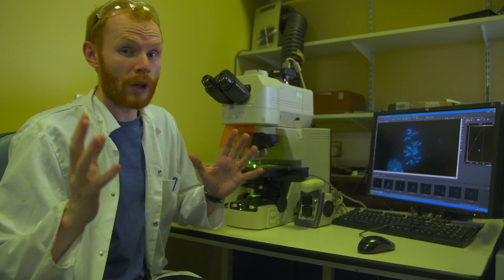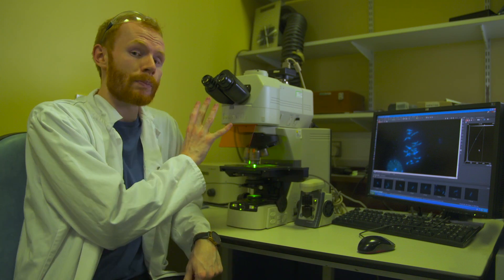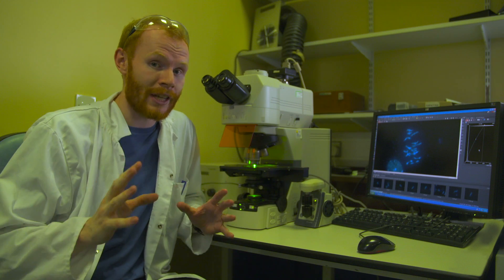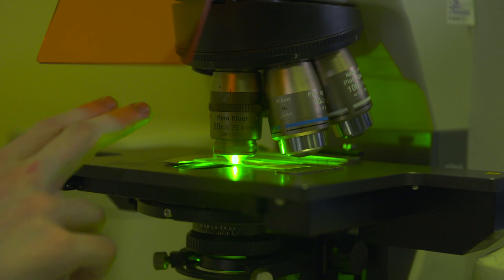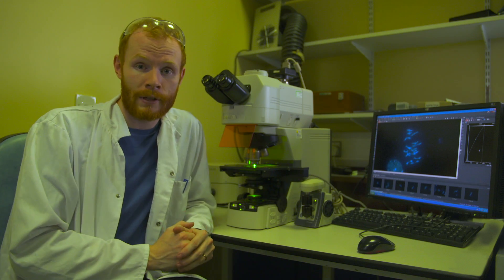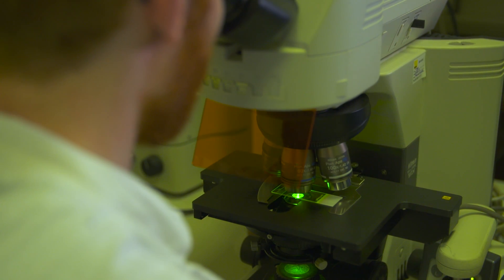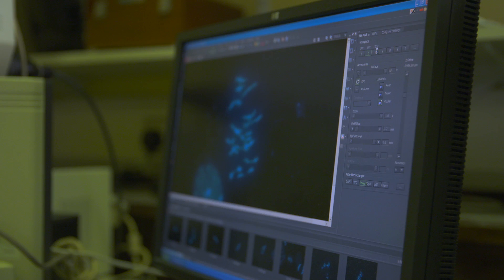Here we're using a slightly fancier microscope than we might find in most schools, but the principles of magnification are exactly the same. So if we have a 10 times eyepiece and a 20 times objective, this gives us a total magnification of 200 times. With this microscope we're using a particular wavelength of light to illuminate our sample. We also have a camera attached which allows us to record our results, but if we were doing this in the classroom, we may need to draw what we see.